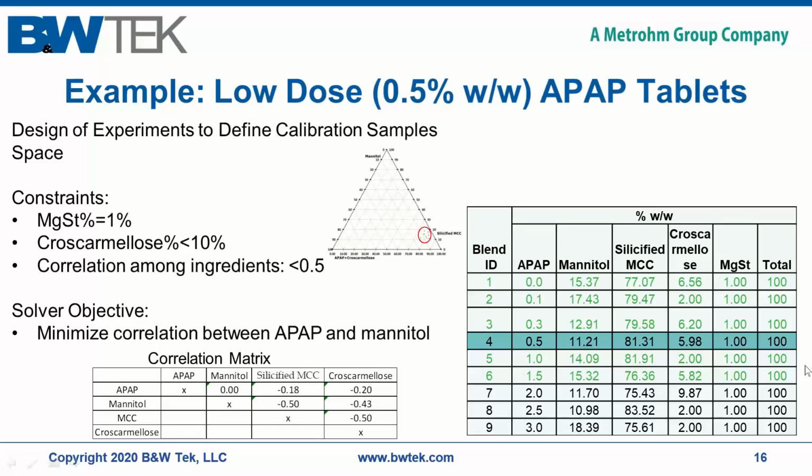And what are the challenges during calibration? The first challenge is making sure that you have samples that sufficiently and correctly span the calibration range that you're interested in, and that you have a reliable reference method. Those are the largest challenges.